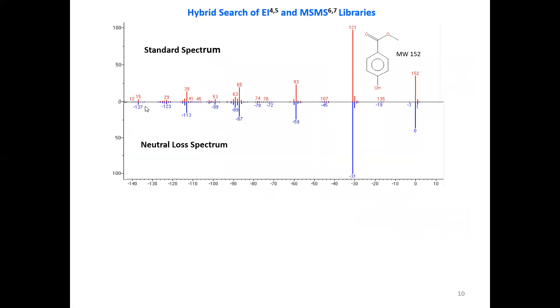So let's talk about the hybrid search. A hybrid search is what it says. It's a mix of two different type searches. Normally, when one searches a library, you take your unknown spectrum and you compare it to the standard spectrum of a compound in the library and get a fit and a rank. When you do the hybrid, it also creates your spectrum in a neutral loss mode. So the molecular ions at zero and then a loss of methoxy here would be a minus 31, and it has these neutral loss spectra for all of the compounds in the libraries that you select too. So it compares this neutral loss to that library spectrum and gives you a fit also.